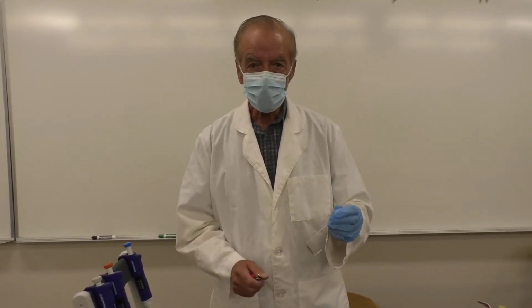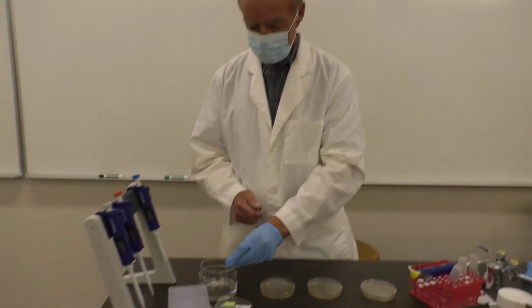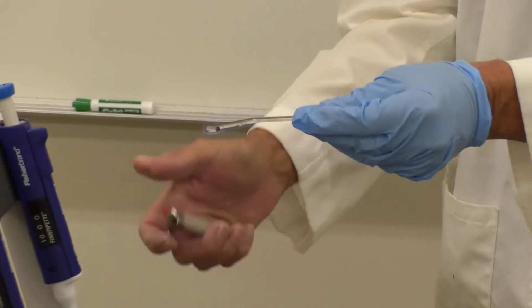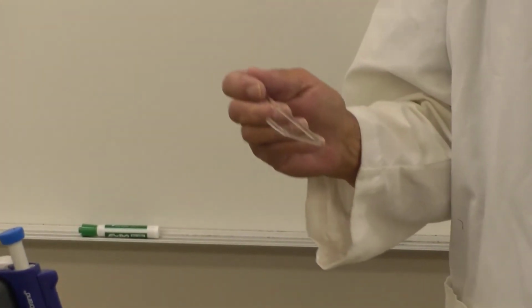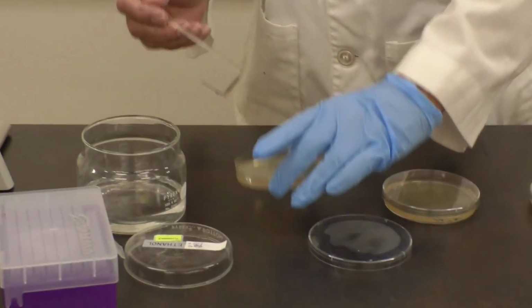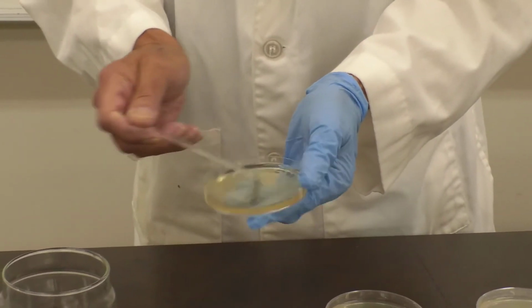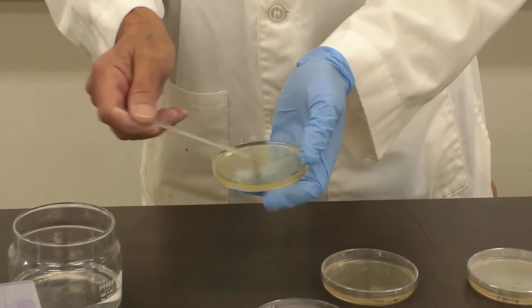So now we're ready to spread the 100 microliters. Hockey stick for spreading. Dip it in the alcohol. Let the alcohol burn off. Never heat glass in a flame because it has a high heat capacity. So, again, use the hockey stick to spread that 100 microliters across the surface.